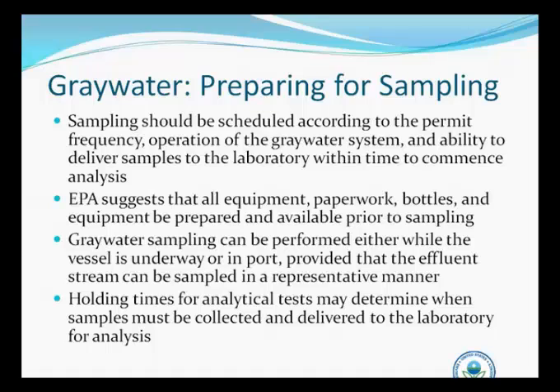One thing that we'll talk about as we get farther along with some of the tests is that the holding times for the tests that you're going to be doing on your water really dictate the best time for sampling. To explain holding times a little bit better, this is the maximum amount of time that can elapse between the collection of a sample and the start of a certain test.